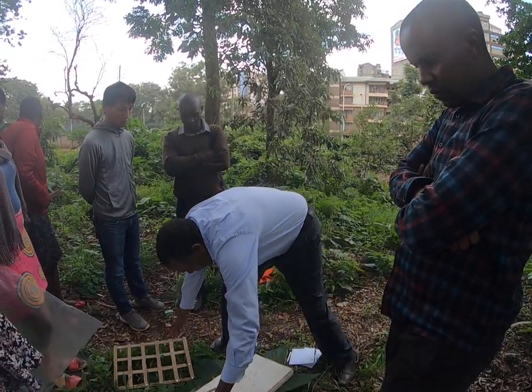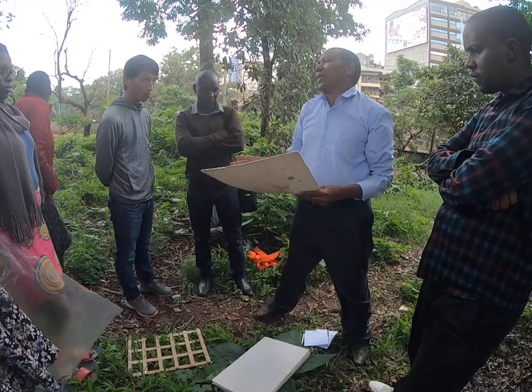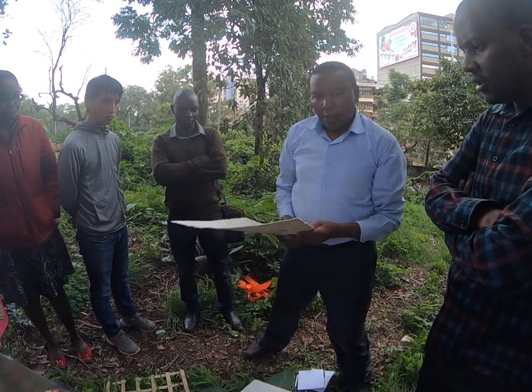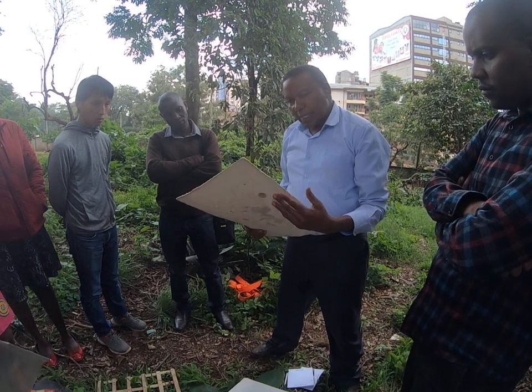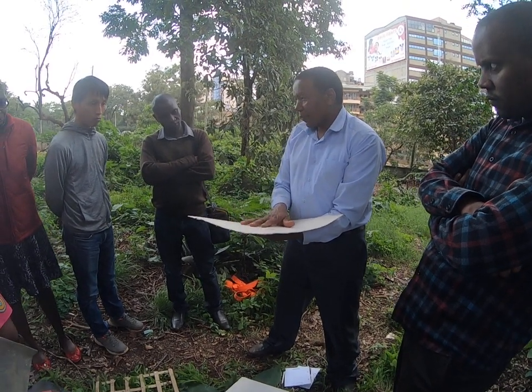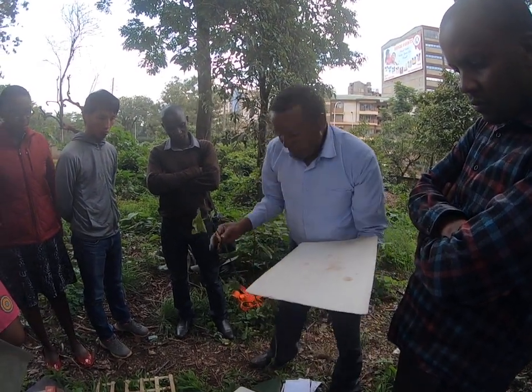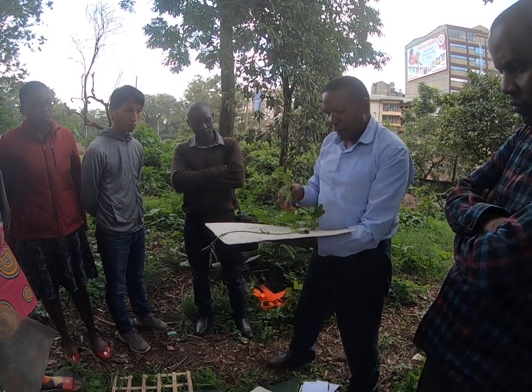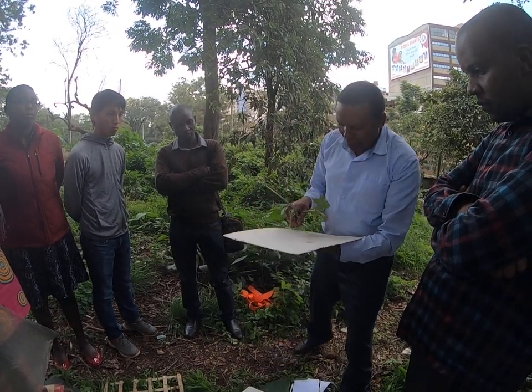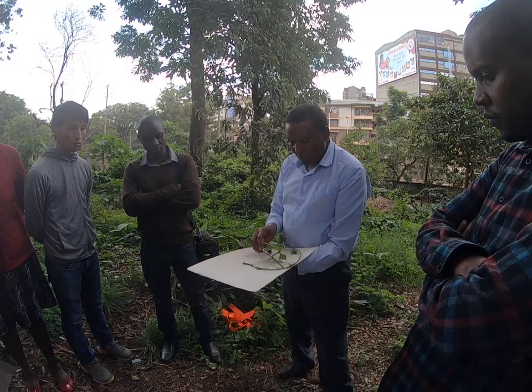Okay? So that's the frame. And then look at this. Although it's not a must if you don't have it, this is blotting paper. And as the name suggests, it can absorb moisture and anything which is wet. So if I collect a plant specimen and it's not dry, this can help in absorbing some of that moisture. Because if it doesn't absorb, what will happen if this stays pressed for 2-3 days? It will start rotting. So that's blotting paper.